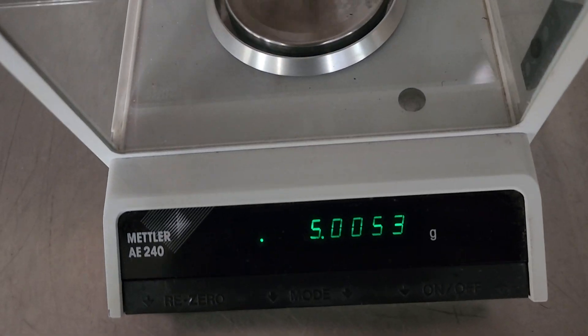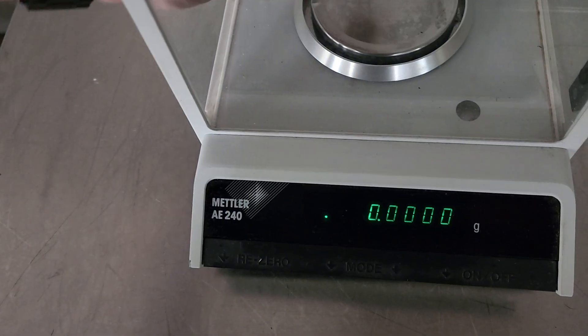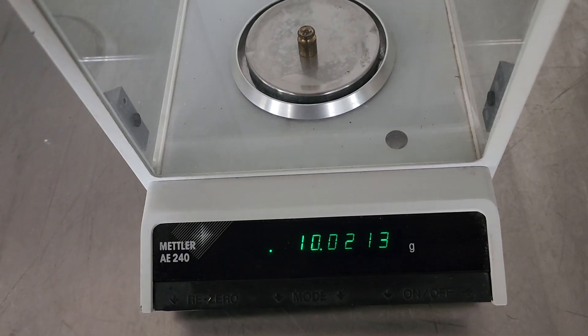So we'll take off the 5. We'll grab a 10 — or it's going to be a 20, I don't know, I can't see them. Yep, that's a 10.